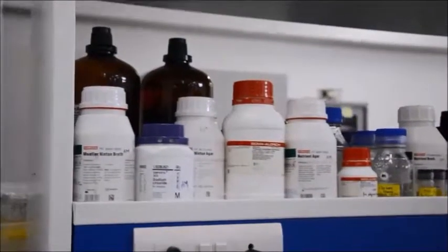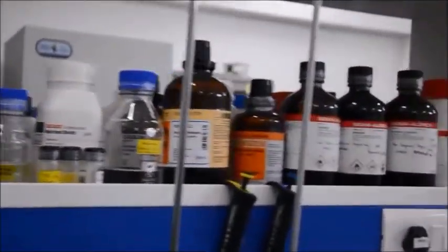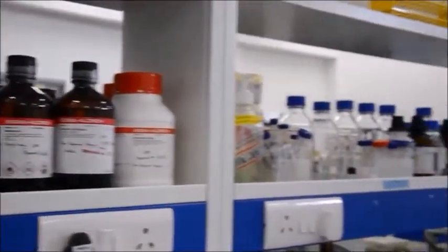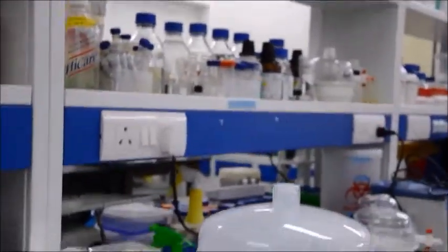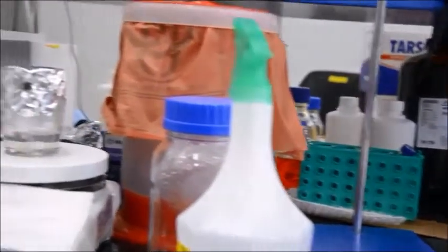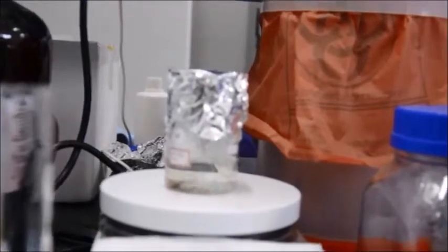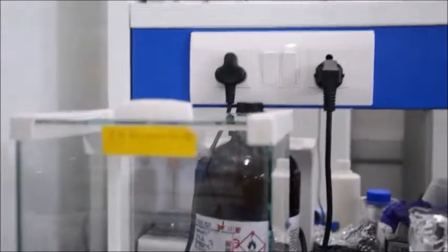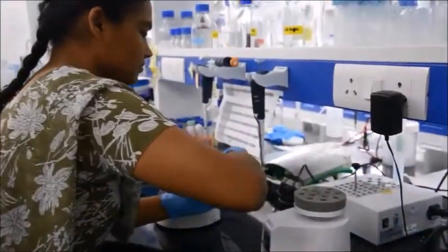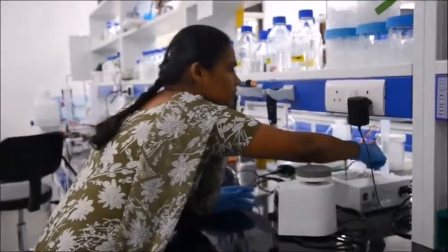The question of proper lab waste disposal requires a prerequisite, which is an ordered arrangement of the laboratory articles. This ensures a smoother mechanism in terms of handling and disposal of the substances. The usage of gloves in the laboratory is important and mandatory for safety purposes.